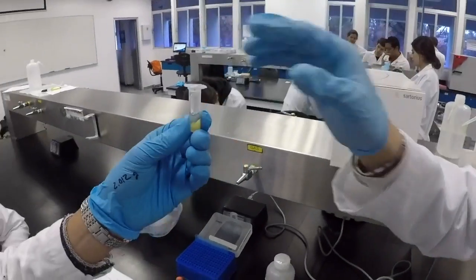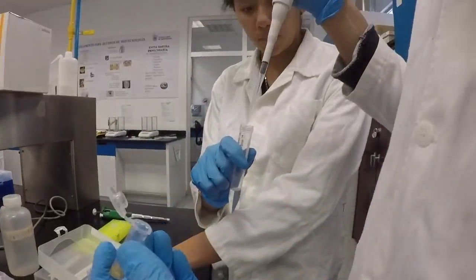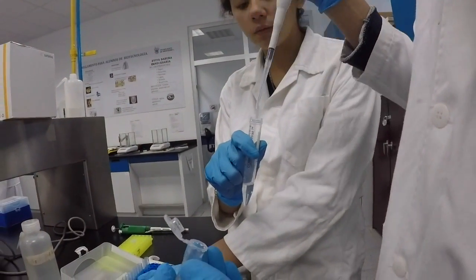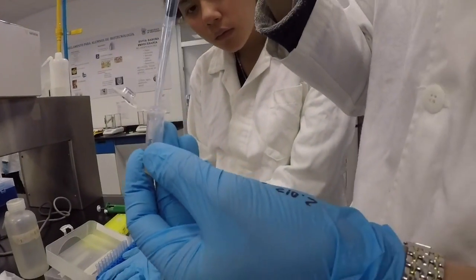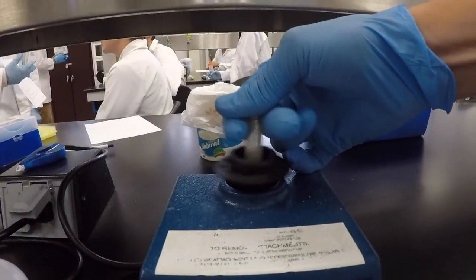Finalizing the centrifugation period, 2 phases were observed in the microtube, so the supernatant was removed and 400 microliters of lysis buffer were added. Then the solution was mixed with a vortex.